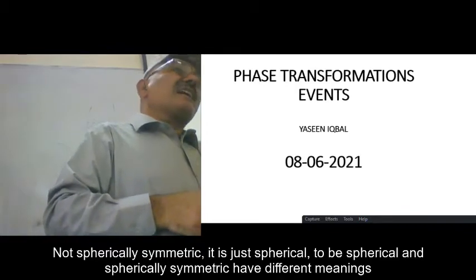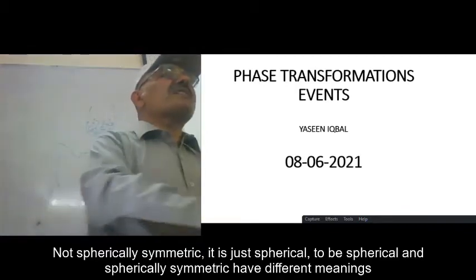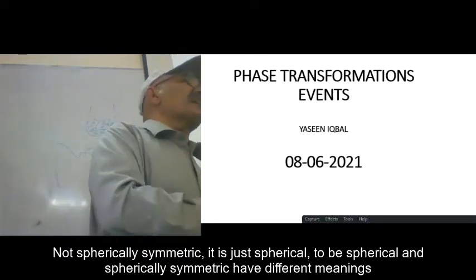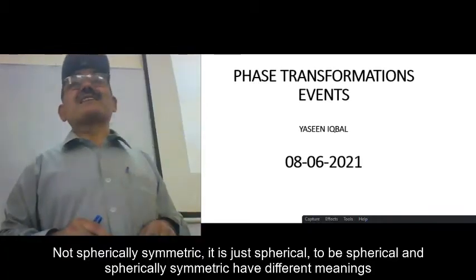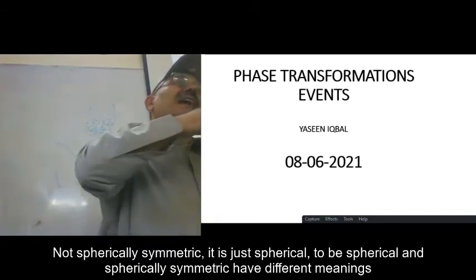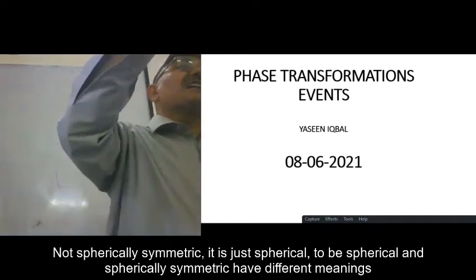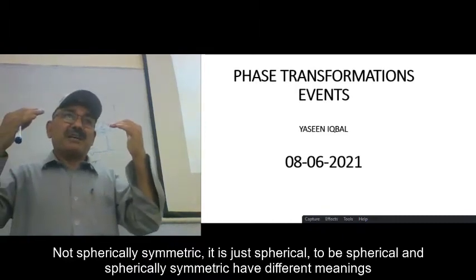Secondly, they make a matrix within the furnace of the powder of the same volatile material, so that the environment of the furnace is populated with that type of ions, so that the volatile ions which are running away are stopped from the outside.